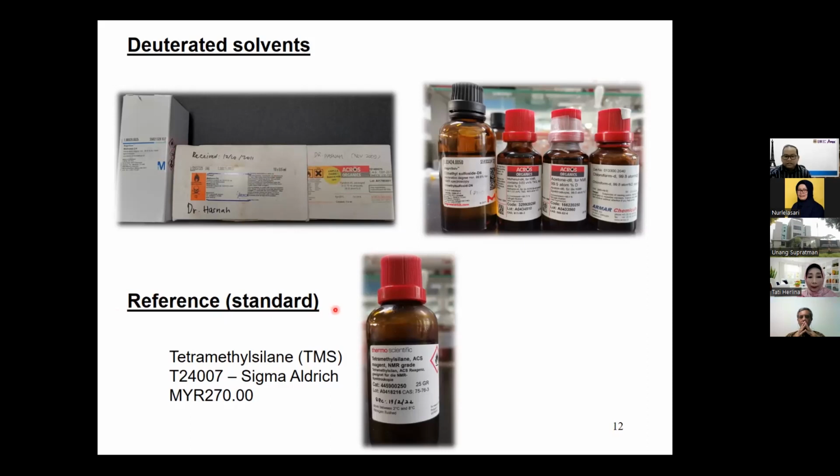The reference standard is TMS. Usually they assure it's around 0 ppm. This is very important because sometimes our sample signals overlap with the CDCl3, for example especially in aromatic regions, so it's good to have tetramethylsilane, TMS. We just put a few drops in these bottles, and we can use it for quite a long time. If you buy CDCl3 that already has tetramethylsilane, it will be very expensive.